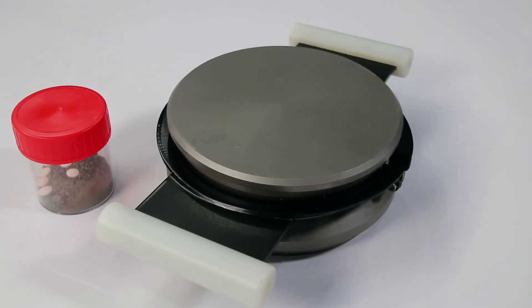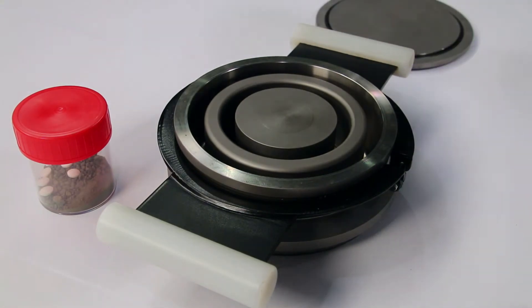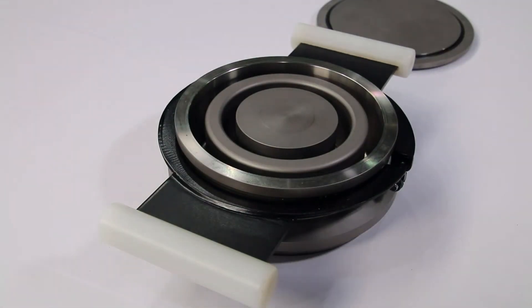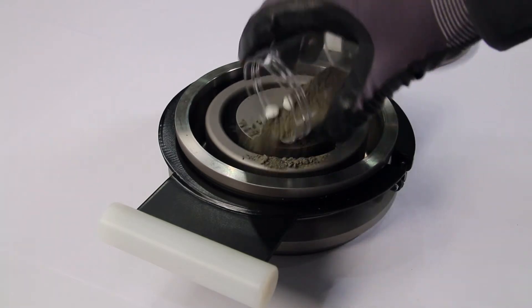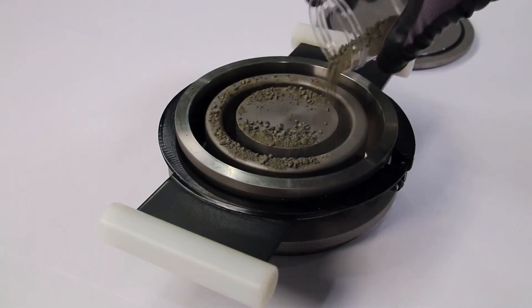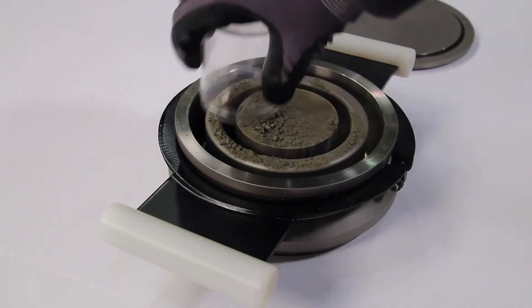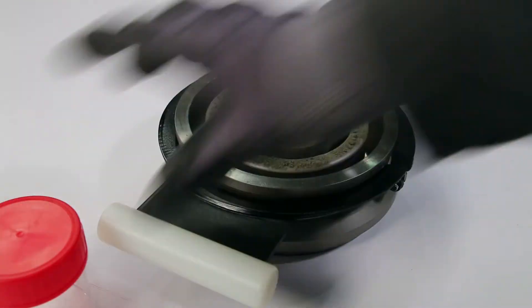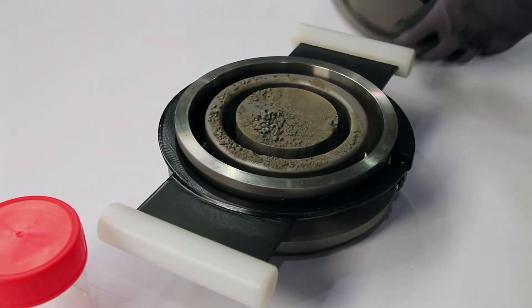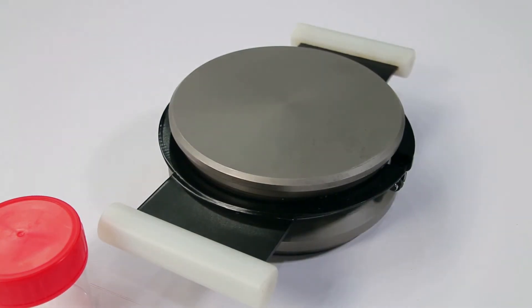The HSM offers a wide range of options to achieve the optimum grinding result for every application. To enable analysis-neutral comminution, grinding vessels and sets are offered in different material qualities including chrome steel, tungsten carbide, corundum and agate. In addition, different grinding vessel volumes between 10 and 250 cubic centimeters allow processing of various sample quantities.